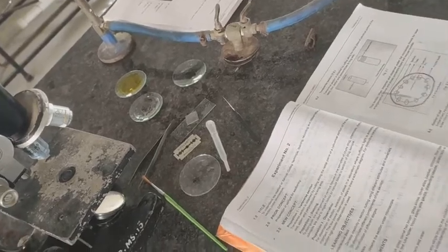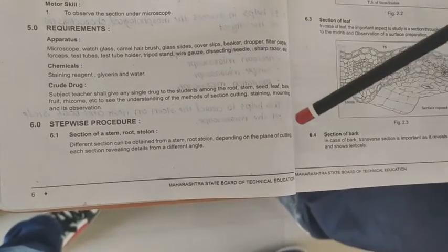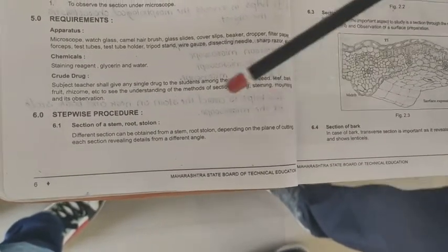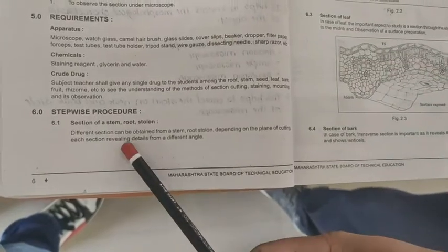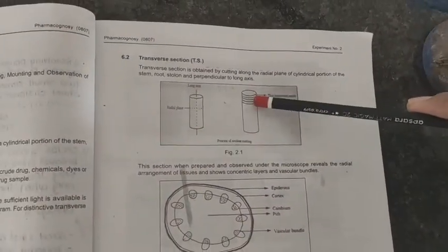Then after that, the procedure: sections of a stem, root and stolon. Different sections can be obtained from the root, stem, stolon, etc., depending upon the plane of cutting. Each section reveals details from a different angle, such as the longitudinal section.